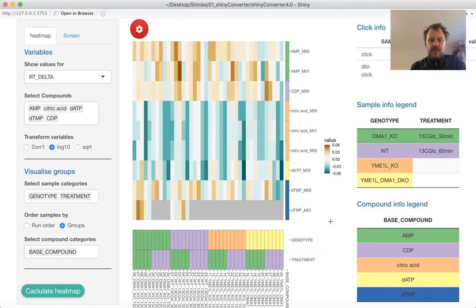If there was some systematic pattern, then probably we'd be able to see it. I mean, clearly the citric acid is coming a bit earlier. Here, AMP is coming a bit earlier than in your lists. Well, that's probably fine. Let's have a look at the MZ delta.